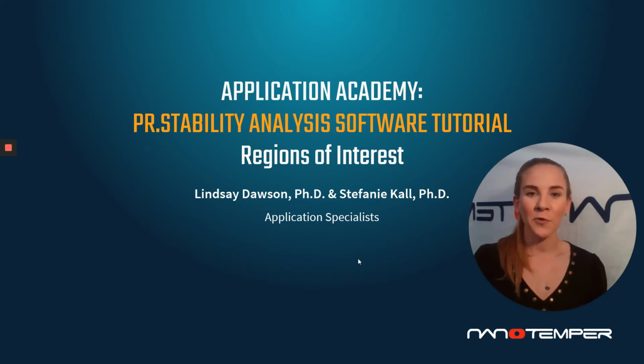In this tutorial, we're going to be presenting a really great feature of the software that is meant to help expedite your data analysis when looking at more complex unfolding profiles. Now, we know when working with these types of samples that it can be very tedious for you to go sample by sample to ensure that all of your inflection points were captured by the PR Therm Control software.